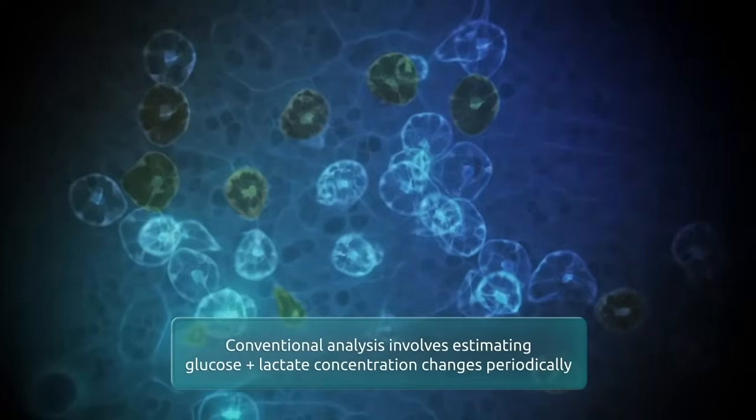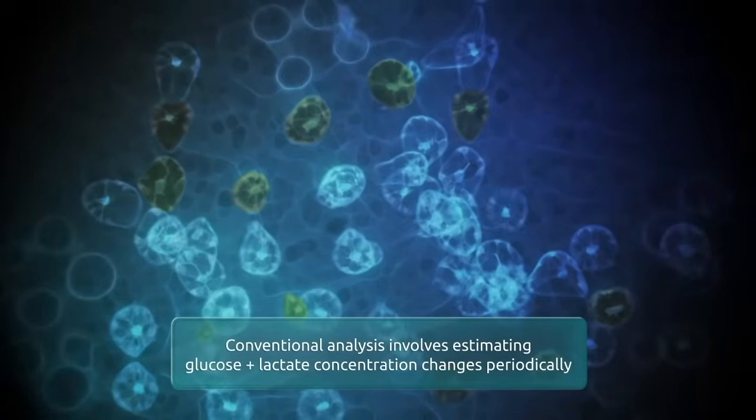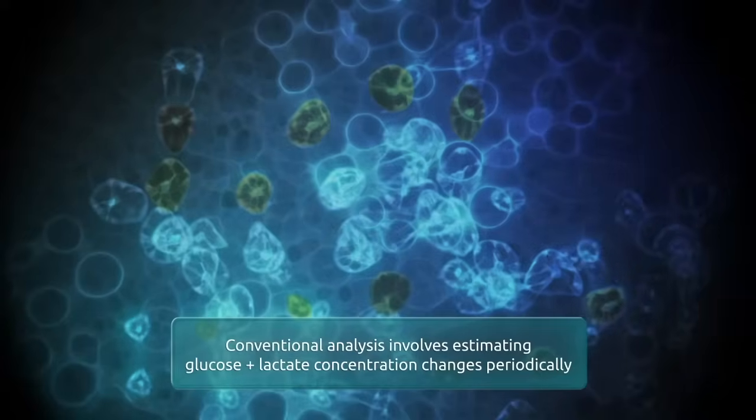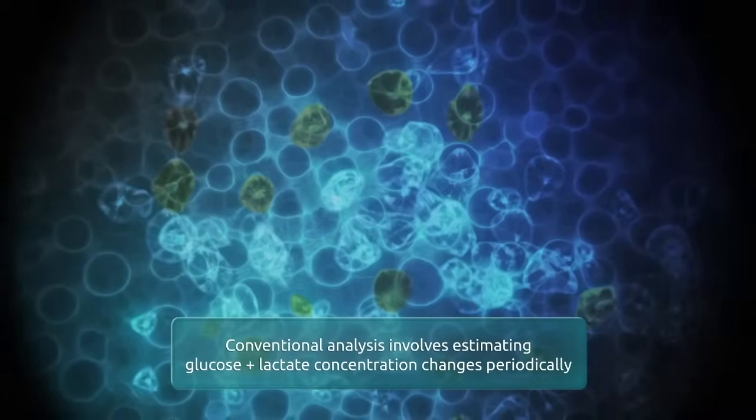Conventional analysis typically involves estimating glucose and lactate concentration changes and is obtained through periodic sampling.